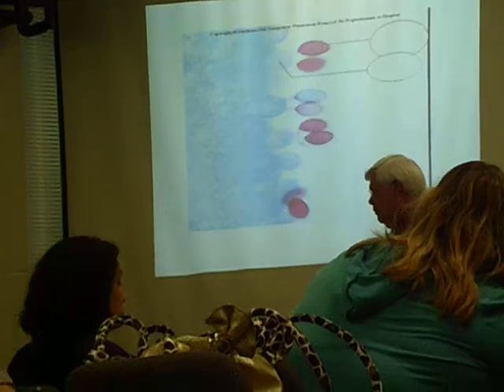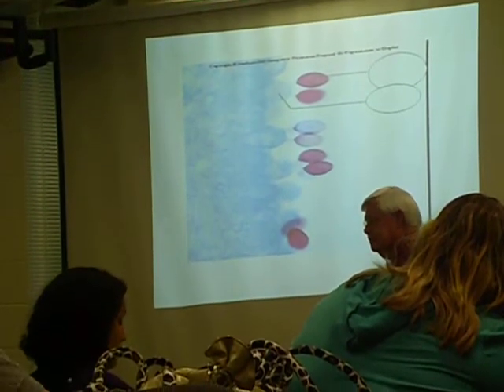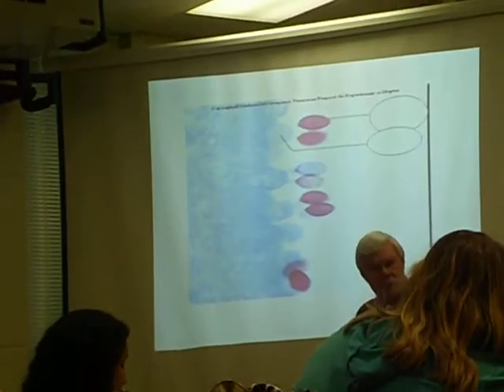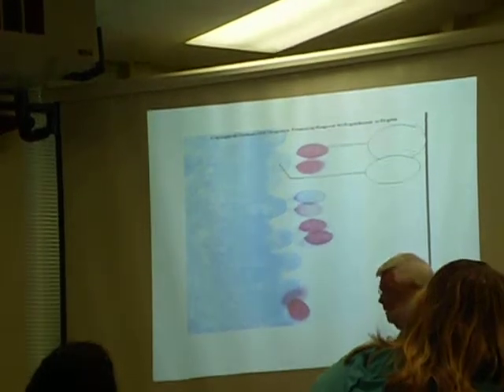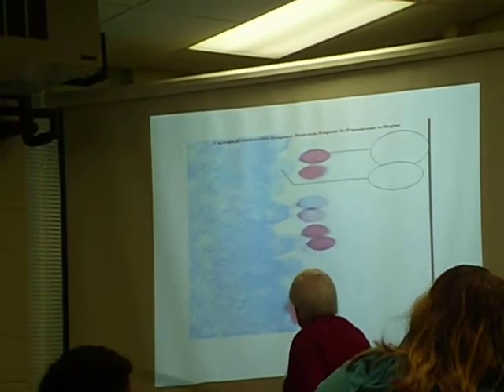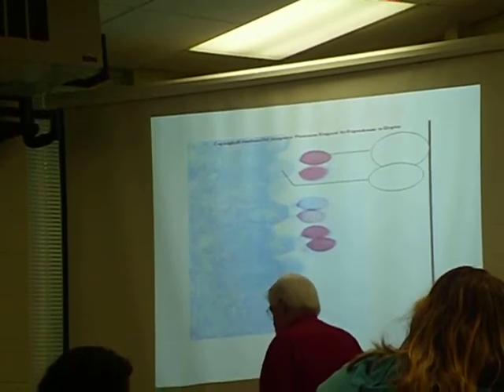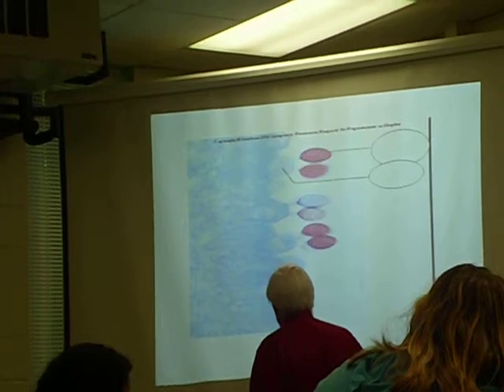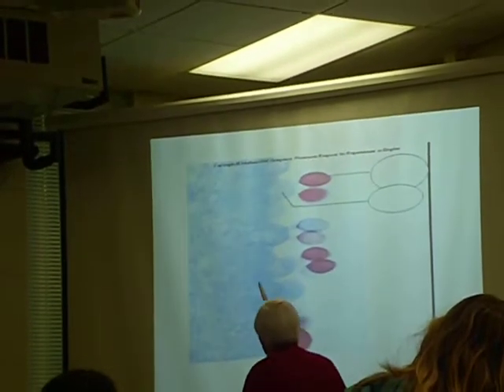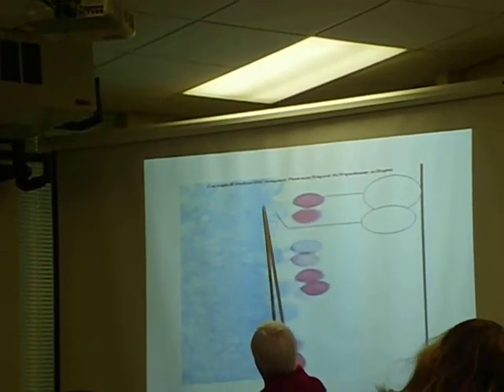What division is represented here? Basidiomycota. What are these structures? Basidiospores. How many are always produced in Basidiomycota? Four. What is this club-shaped, enlarged end of the hyphae called?